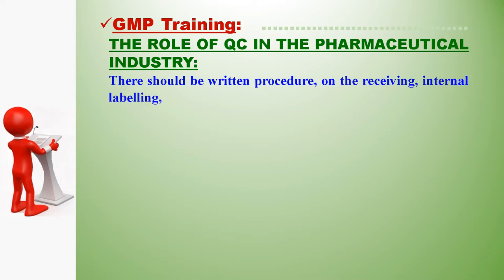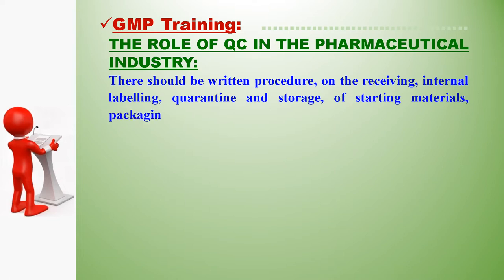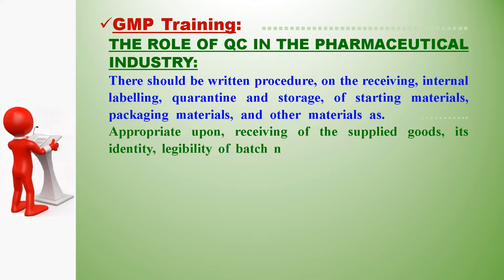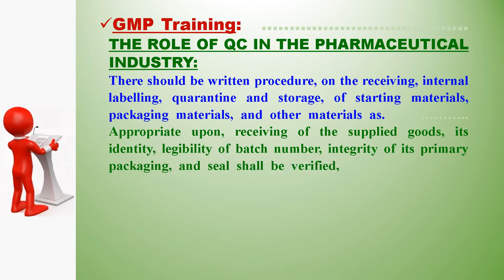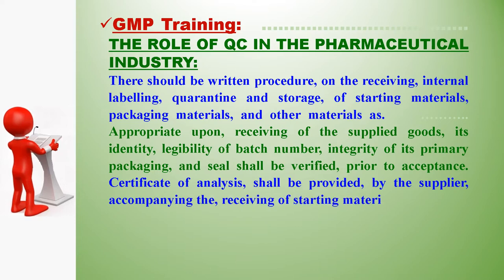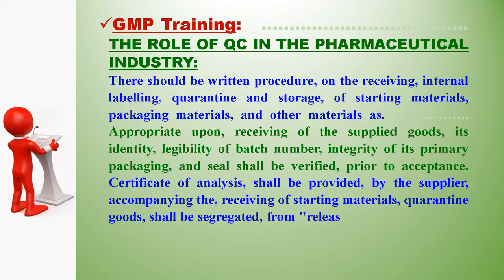There should be written procedures for receiving, internal labeling, quarantine, and storage of starting materials, packaging materials, and other materials. Upon receiving supplied goods, identity, legibility of batch number, integrity of primary packaging, and seal shall be verified prior to acceptance. A certificate of analysis shall be provided by the supplier. Quarantine goods shall be segregated from released goods, and rejected goods stored in a defined area with controlled access, such as a locked area.